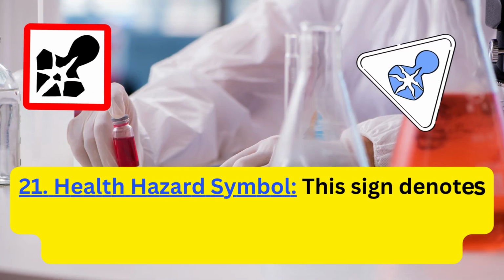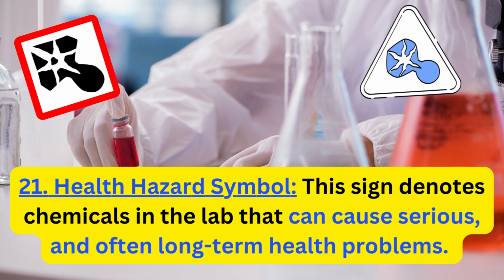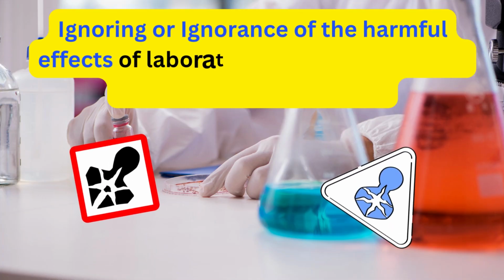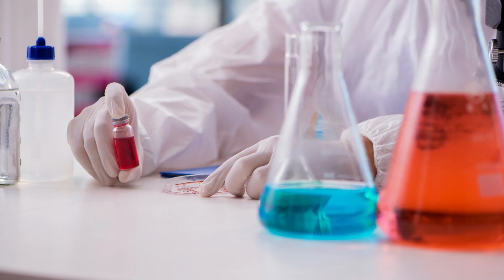21. Health hazard symbol. This sign denotes chemicals in the lab that can cause serious and often long-term health problems. Ignoring or ignorance of the harmful effects of laboratory materials can have even fatal consequences.